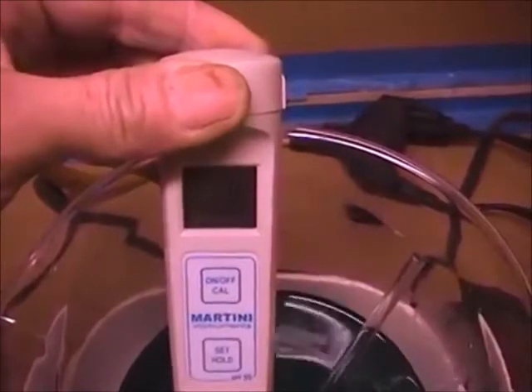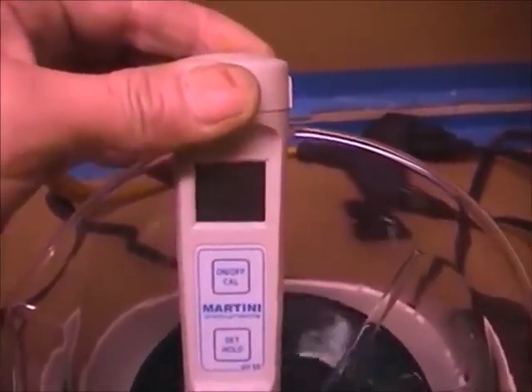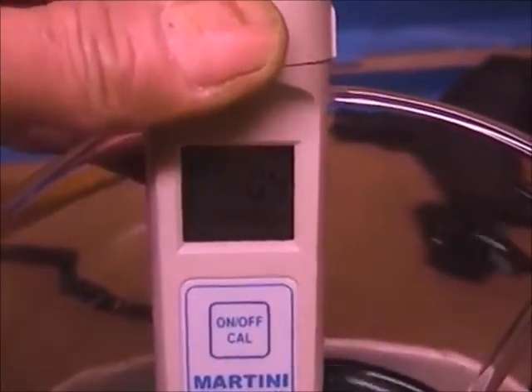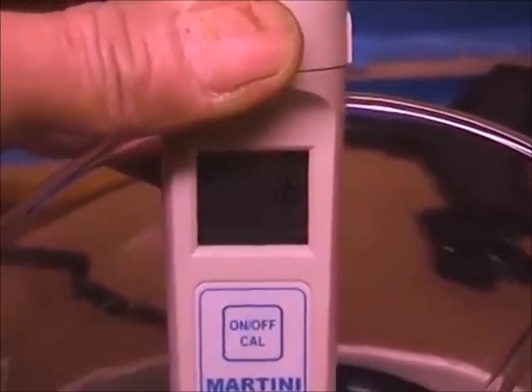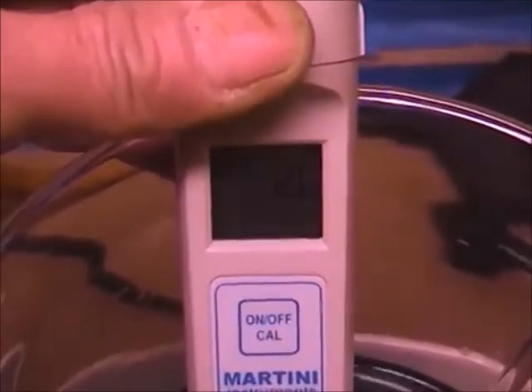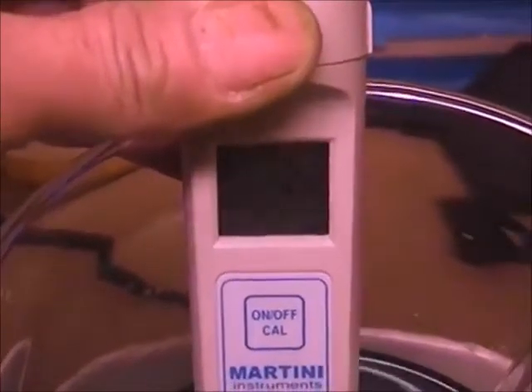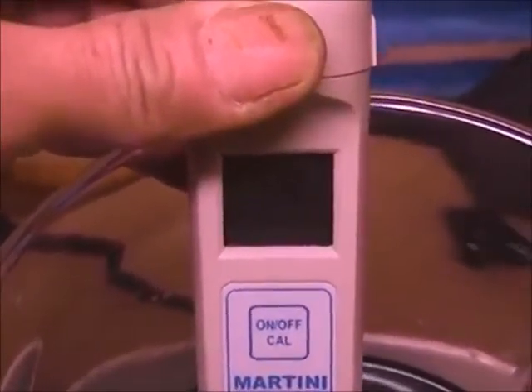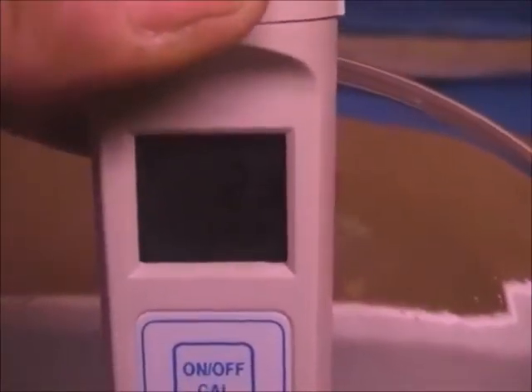Our solution's at 140 degrees. And the pH is at 0.4, 0.6, 0.7, and it's starting to rise. 1.6, 1.7, 1.8, 1.9, 2, 2.1, 2.2, 2.1. So as you can see, we're right around the 2 mark, and at 140 degrees. Now let's go over here and check our other beaker. And we're at 135.9.